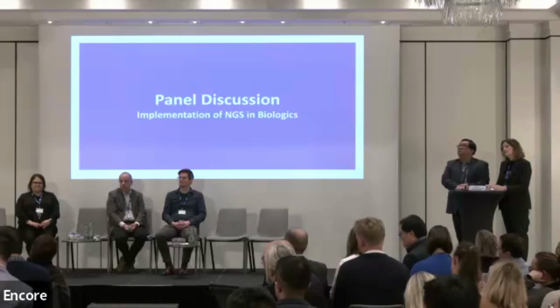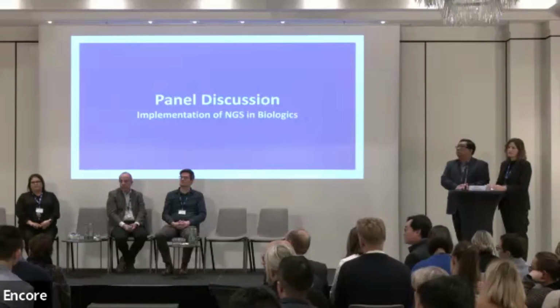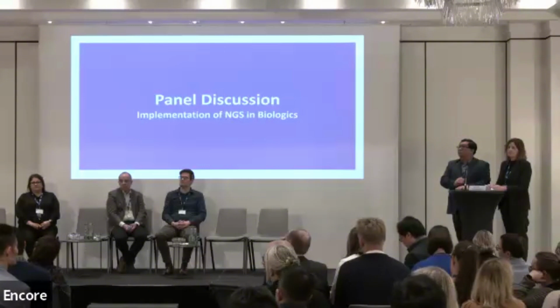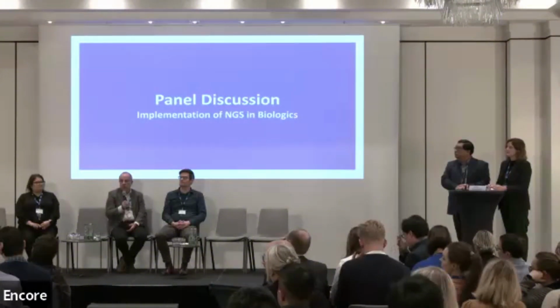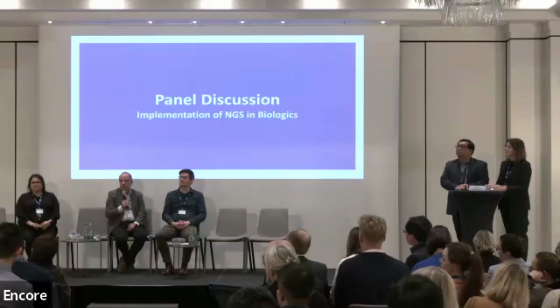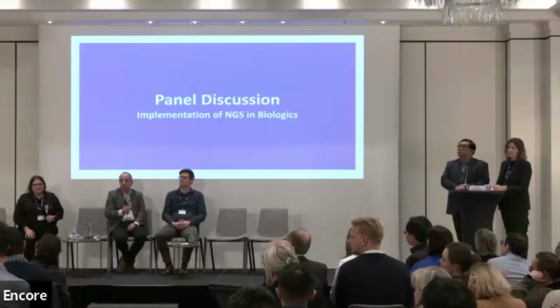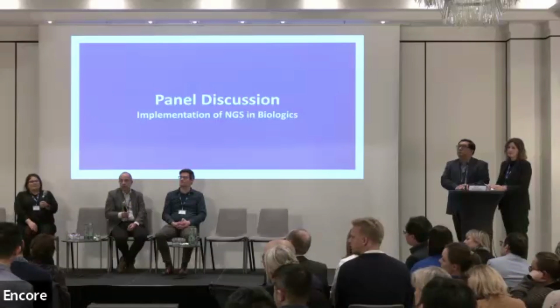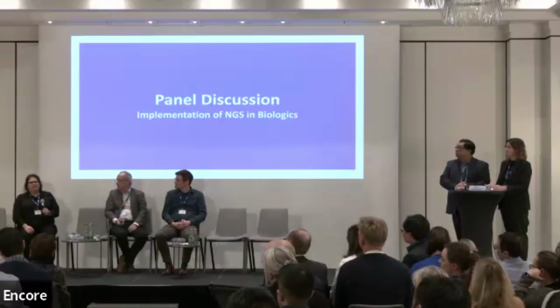If you have backgrounds coming from individual patients as opposed to a well-defined cell line, how does that affect the bioinformatics? Or do you think that it wouldn't? Do you think you would still be fine in terms of that removal step? I just imagine that there would probably be a lot of differences in terms of endogenous things, patient to patient variability. So just throwing that out there.